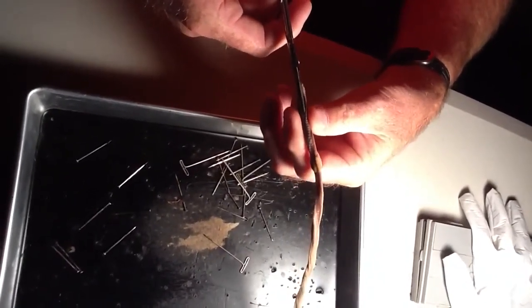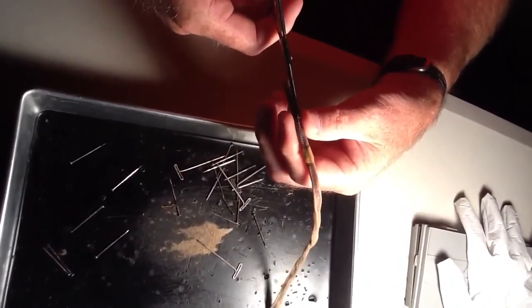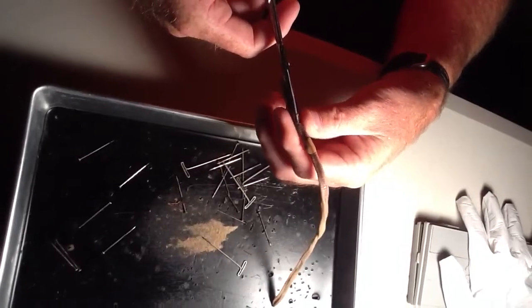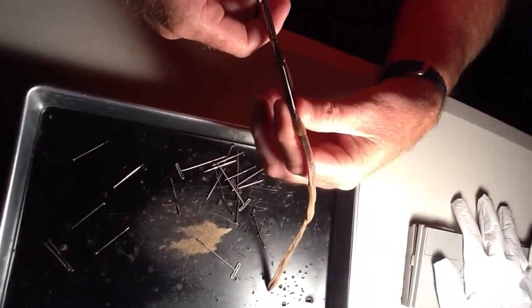And it cuts real easy. You can almost just unzip it like you did the worm. You just need the scissors. Something should not come out like that. And this is hit and miss. I'm about 50-50 with doing this really well and doing it okay.